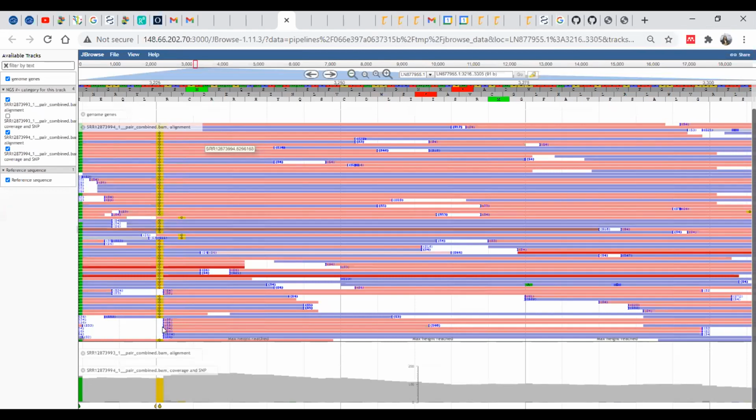In a long sequence, now in this example, we have a very short genome. This genome is about 18,000 nucleotides long, and therefore we can easily see where we have our data and where we have the variants. If you go to the top, you have a drop-down. If you have just a single genome like this one, it will just be one thing. But if you have, for example, the human genome with all of the chromosomes, the individual chromosomes will be in that drop-down, and you will be able to see individual results.